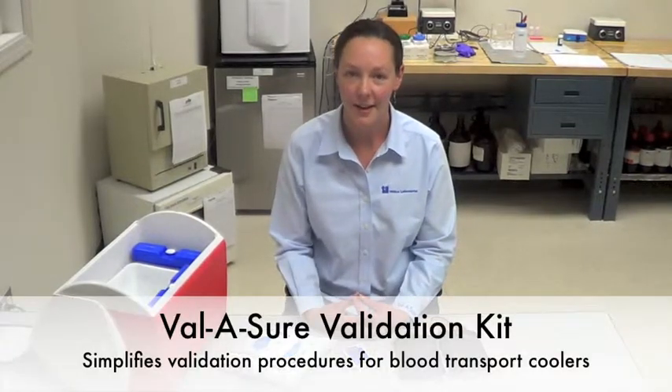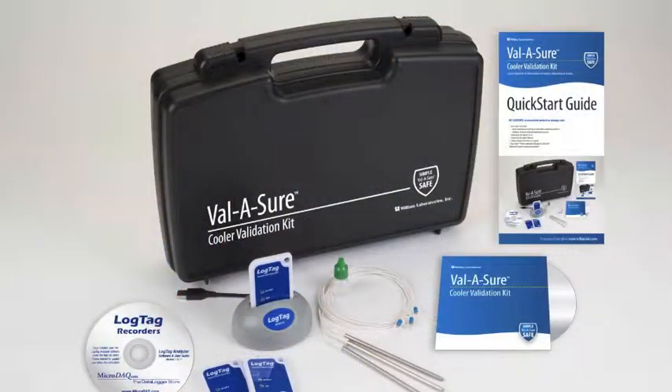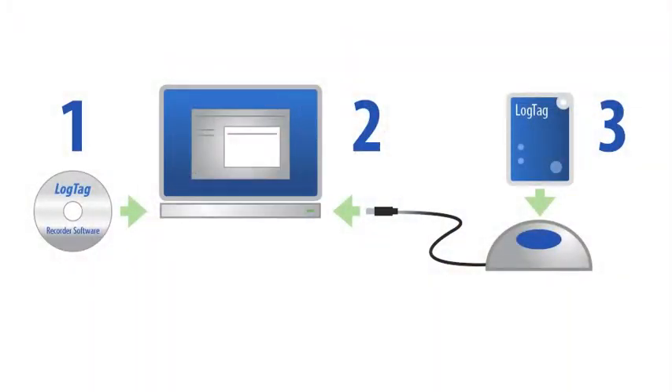Valishore is a validation kit to help you simplify your validation procedure for your coolers. Be sure to install the software on your computer and configure the temperature recorder before you start this procedure.